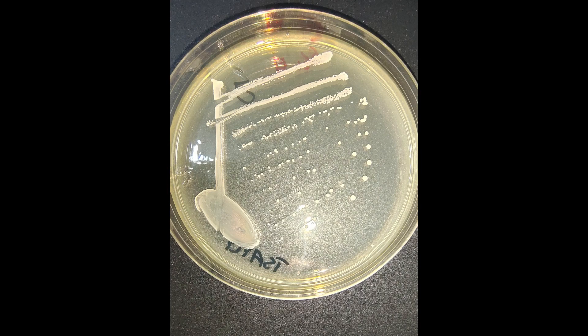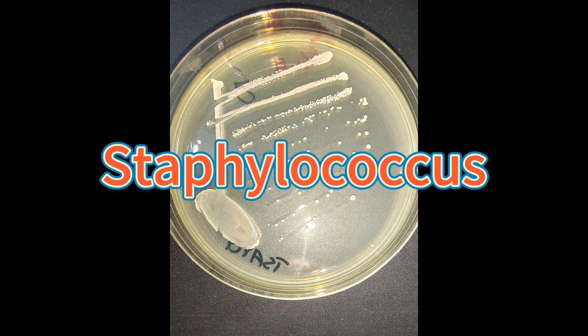The second one is this white, small round colony, and it's a gram-positive coccus. Both AI and me agree it belongs to the genus Staphylococcus, and we both got a point for the correct answer.